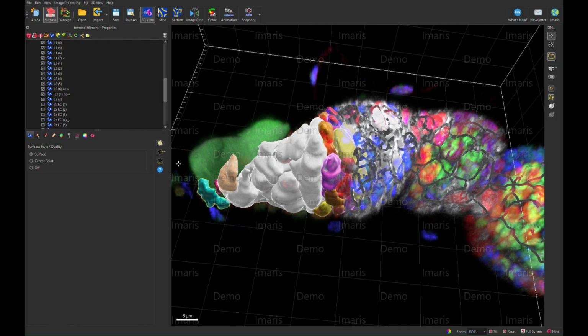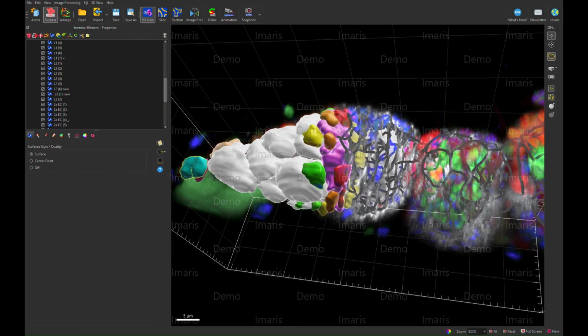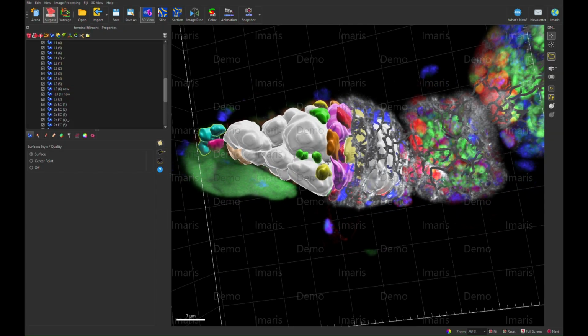Okay, and then after the layer 3, we're going to have escort cells, which are going to be marked here in green for the 2A escort cells. That's the more posterior escort cells. We've got one large green one here that's really hugging that rounded 2A cyst there. And these are going to help package those cysts. We've got 2 more tiny 2A cysts here. And we're only seeing their main bodies. We're not seeing their projections, but they have these cell membranes that expand out from them and surround and package these 2A cysts and help to keep them packaged properly as they mature and grow in the posterior direction through a germarium.